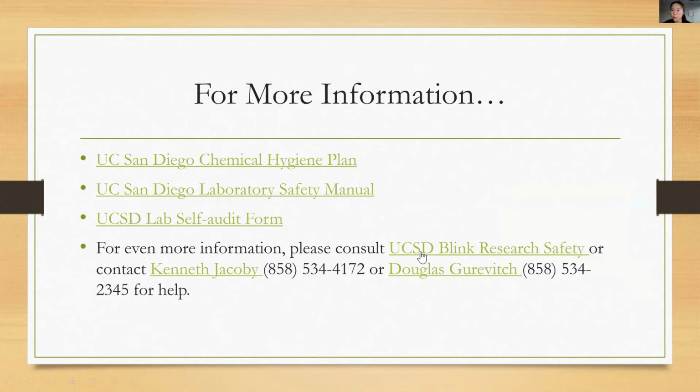And the last thing is the lab self-audit. By UCSD rule, we need to perform a lab self-audit semi-annually, and also a department lab safety audit annually.